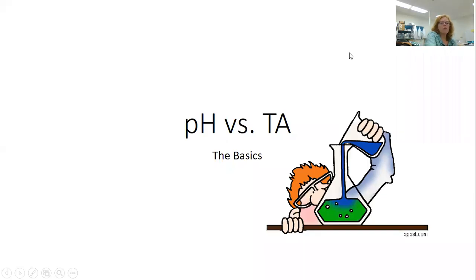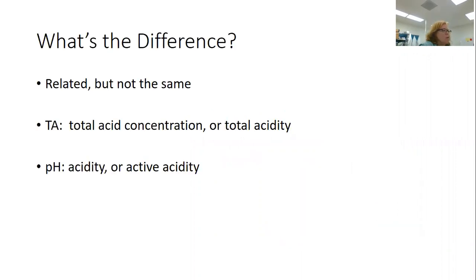Okay, so this lecture is for Quality Lab Skills 1, and it talks about the difference between pH and titratable acidity. So essentially, we use them for the same purposes, but they're not identical. We talked last week about titratable acidity being the total acids in a solution or in a product. So in this case, milk. So not just the free hydrogen ions, but all the bound acids that are inherent to the milk. And then pH strictly measures the concentration of hydrogen ions.